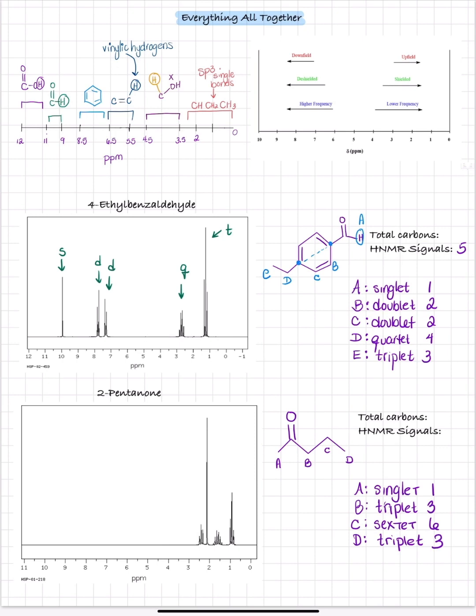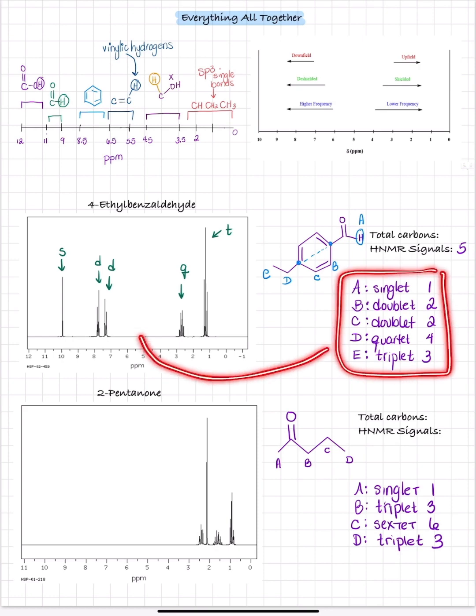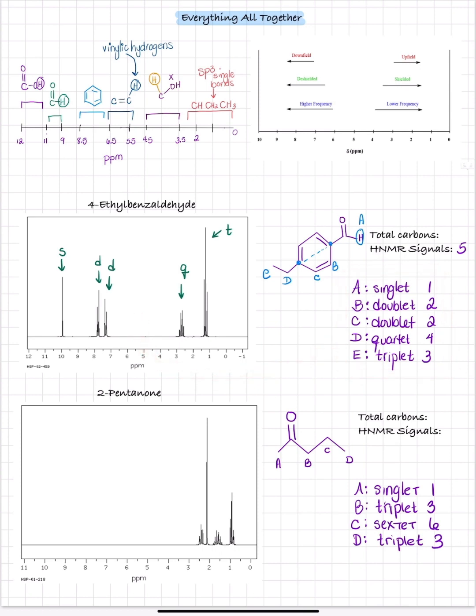And then when it comes down to the biggest part, we did the multiplicity in order to now match it with what is labeled. Now, every so often, they may not have these labeled symbols for you, each one of the multiplicity signals. Sometimes you'll have to actually look at these dots in order to tell that it's a triplet. So I put those items in there to make it just a little bit simpler for matching purposes. So now that you have yours on the left, let's go ahead and just put the letters there, and then we'll talk about the downfield and upfield.